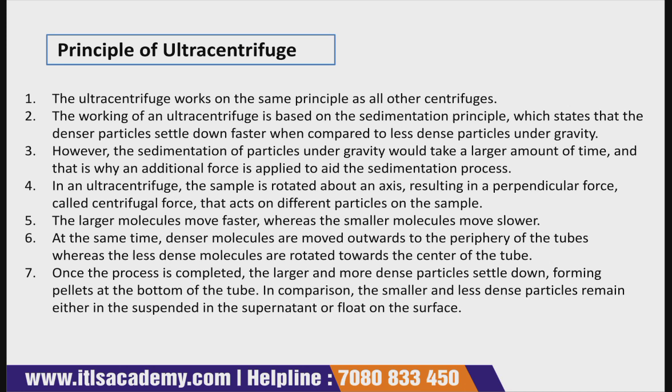And apart from this principle, once the ultracentrifugation process gets completed, the larger, or you can say the more dense particles, settle down, and when they settle down, they form a pellet at the bottom of the tube. In comparison, the small and less dense particles either remain suspended in the supernatant, or sometimes they float on the surface. So on this principle the ultracentrifuge generally works.